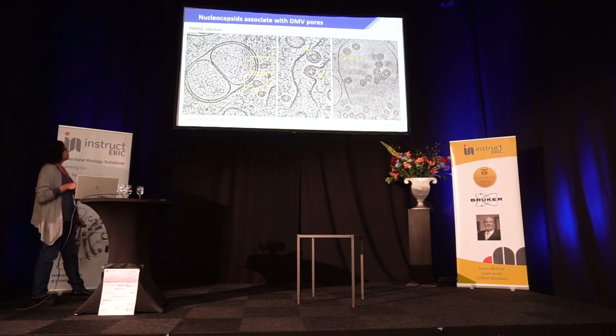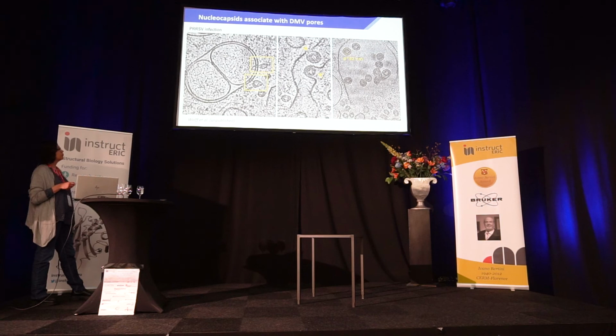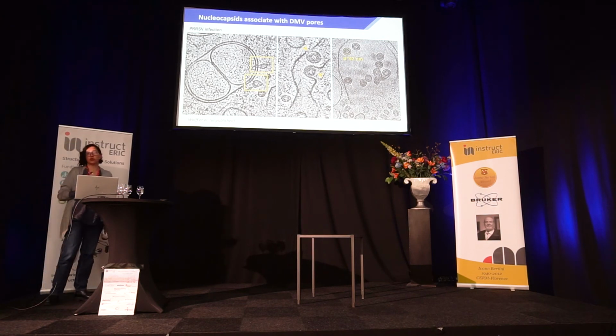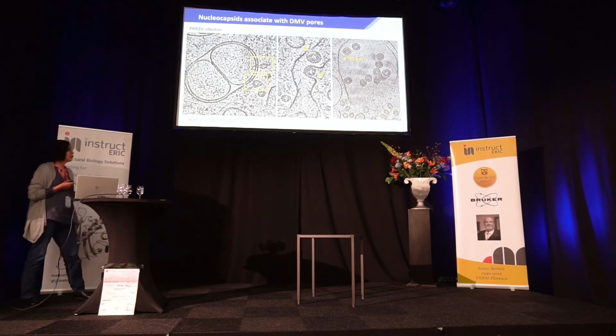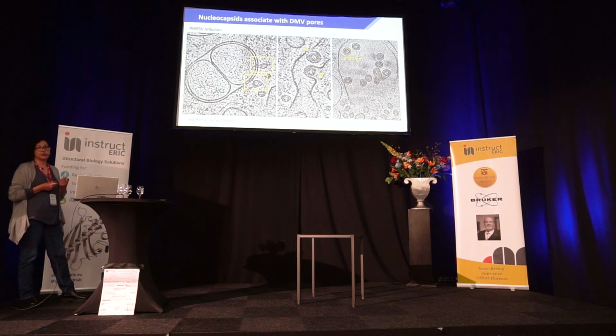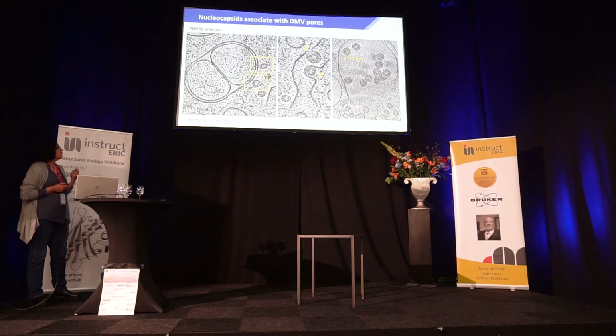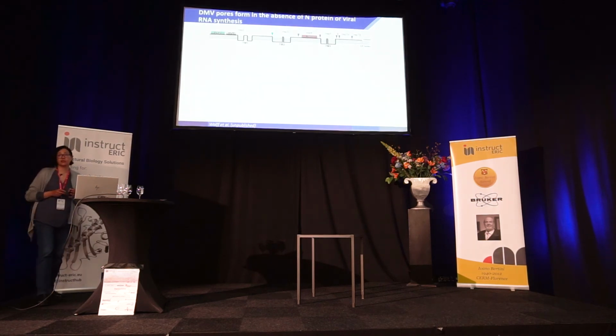And there are some even striking instances where you can see a fiber that seems to go towards the pore and then tether the nucleocapsid. So this supports the hypothesis that we have for coronaviruses, that perhaps these pores help couple the export with the encapsulation.